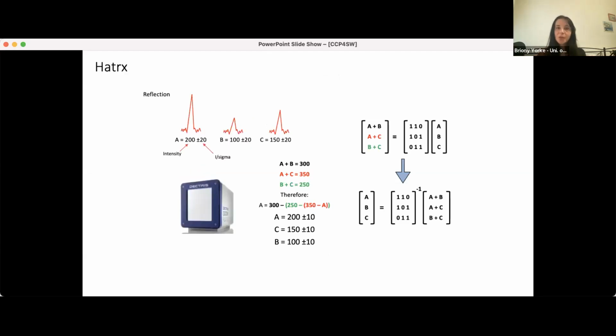So how does this work with time resolved crystallography? Well, if we have a reflection at 3 different time points, it changes in its intensity. We then can just measure that reflection at different time points according to our Hadamard S matrix, record our multiplex data, which has the combined intensities, and then take that data once we've found our spots, once we've indexed and integrated it, and get out our individual time resolved data sets.